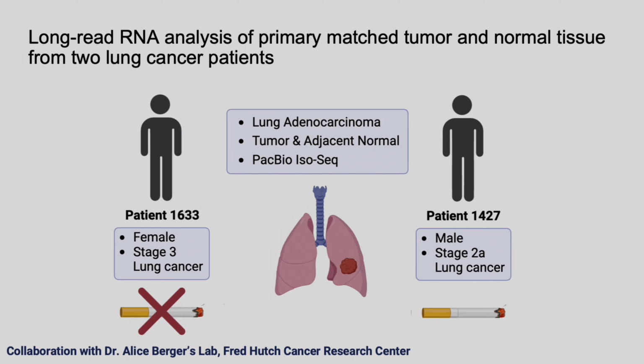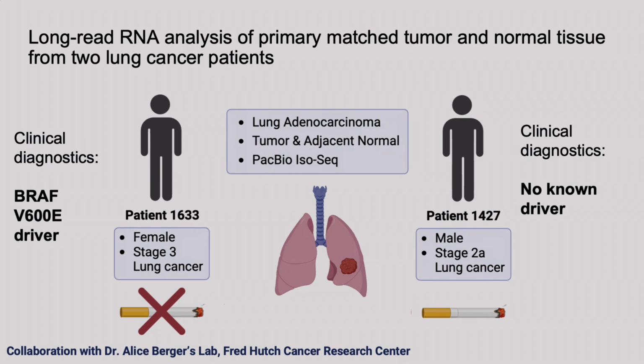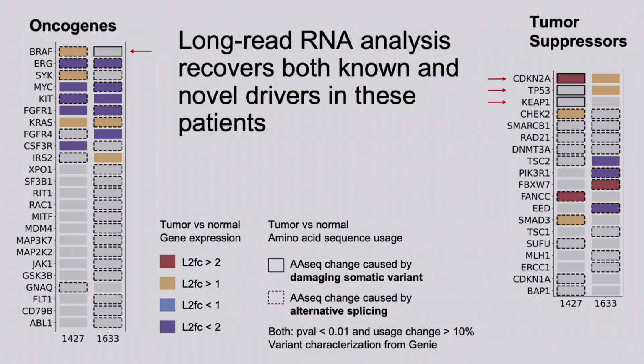And this sequencing was done with PacBio Iso-Seq, and we're moving forward with PacBio Iso-Seq for the remaining cohort of 60 tumor and tumor-adjacent normal samples. Now, these patients each had clinical diagnostics run. So one had a BRAF V600E driver, while the other had no known driver.